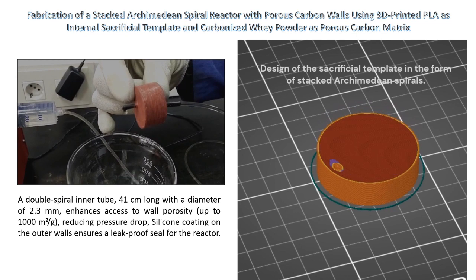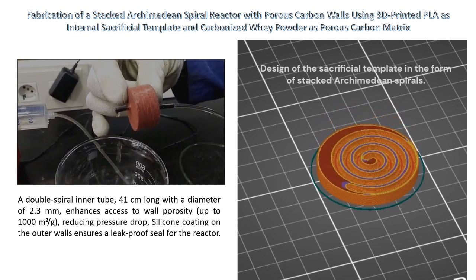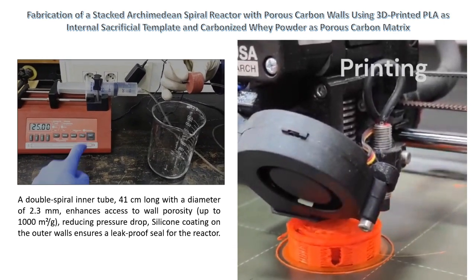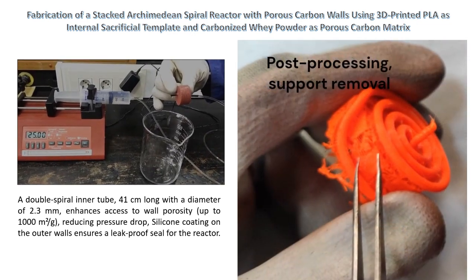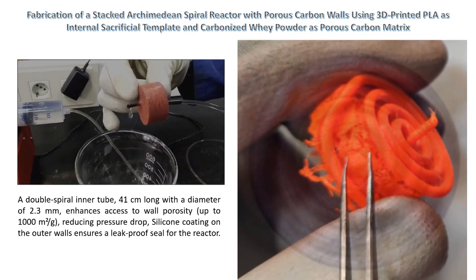Whey powder, when sintered at 150 degrees Celsius, forms solid pieces that, upon subsequent carbonization, yield highly porous carbon objects while preserving the original mold shape. Temperature control is crucial during the fabrication process to ensure successful whey powder sintering before the PLA mold starts melting.